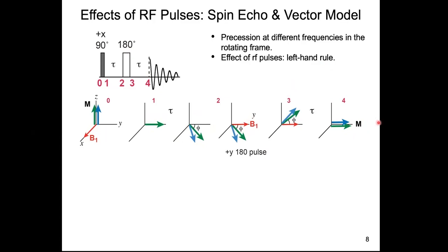Okay, all right. You might say, why do I want to do this? Why don't I just start detecting right at this point if it looks the same? It's almost the same, not completely the same. Well, on a completely practical level, if you do detection after having a free period with no pulse, there are no artifacts, very little ring down problem from the applied pulses. And then, of course, there's another spin dynamic reason: you use this basic module to do relaxation NMR measurements, where as this waiting period gets longer, you will see that the size of the magnetization vectors will shrink because of relaxation. So that's something useful.